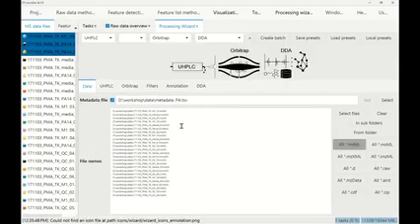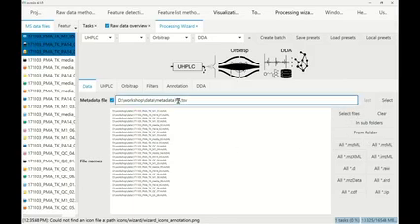And then it's also going to pick all the mzML files. It's sometimes quite nice if you can even say "all in subfolder", and then you can search in your data folder for all the mzML files that you have, and it's going to basically show you how much data you actually have on your drive.